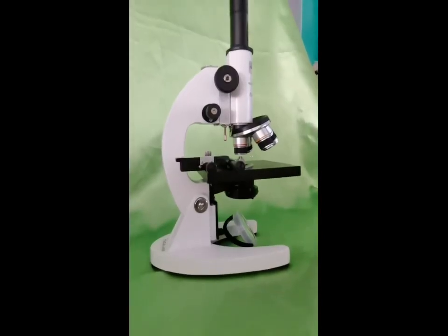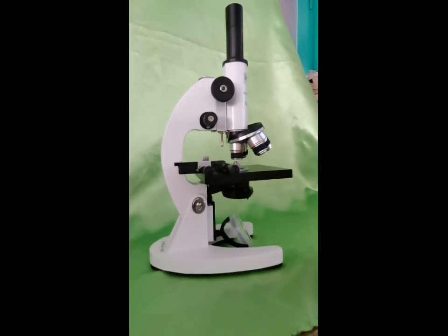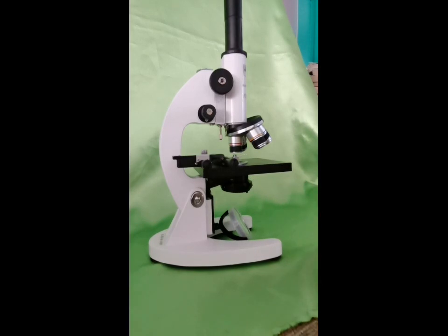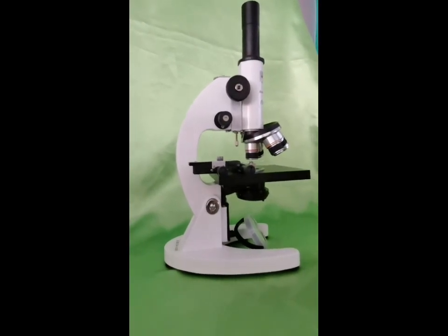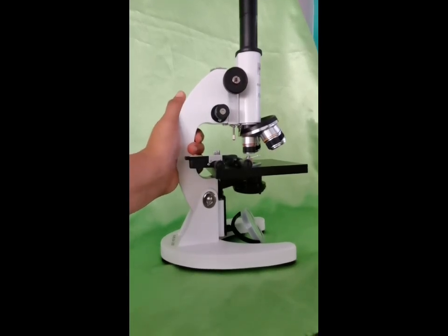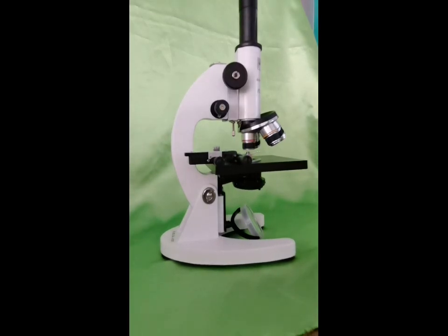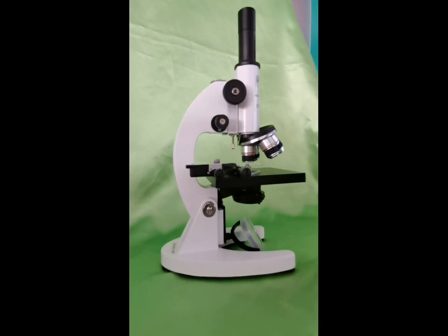Lastly are the mechanical parts, which include the following. First is the base. It is a U-shaped structure. It supports the entire weight of the compound microscope. Next is the arm. It is a curved handle of the microscope. It connects the base and the body tube. It serves to support the entire microscope. It is also used for grasping and holding the microscope when transporting.